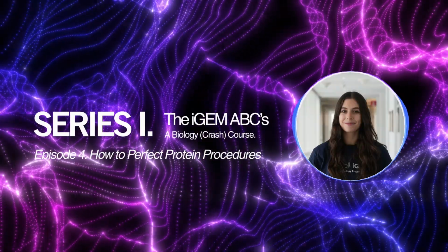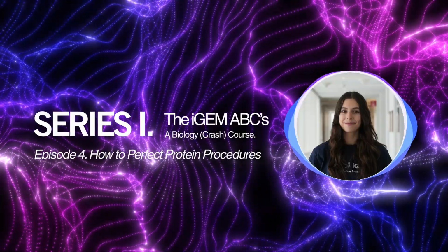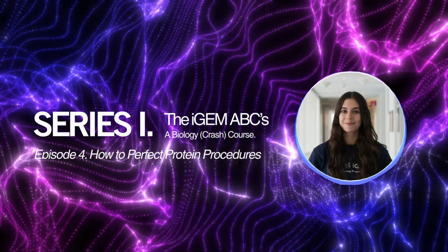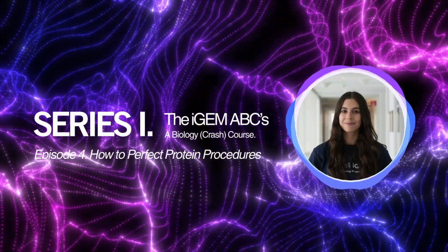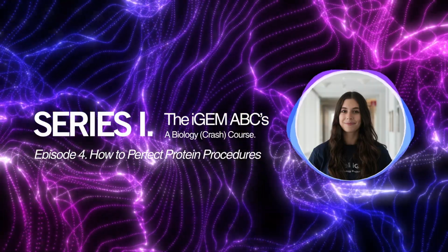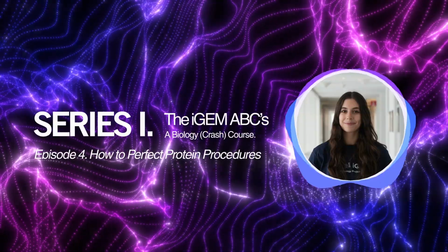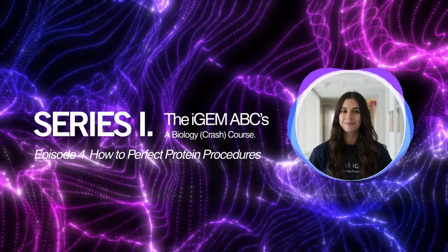And this buffer is typically rich in salt, which breaks electrostatic interactions, so positive, negative regions of different proteins can sometimes attract each other through electrostatic Coulombic interactions. And the salt will break apart these ionic bonds. We also add a little tiny bit of imidazole to this buffer. And as you might recall, imidazole is that molecule that coordinates well to transition metals. And it'll coordinate so well that it'll kick off these weakly attached proteins. So proteins that are attached by maybe one or two histidine residues will be kicked off by the imidazole. But ideally, our protein of interest, which is attached by 6 to 10 histidine residues, won't come off as easily.